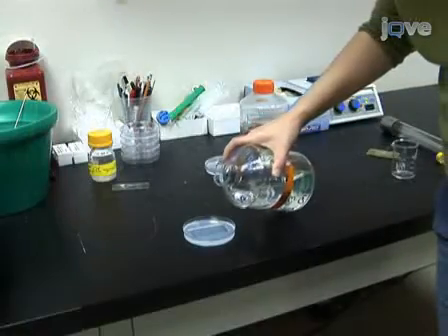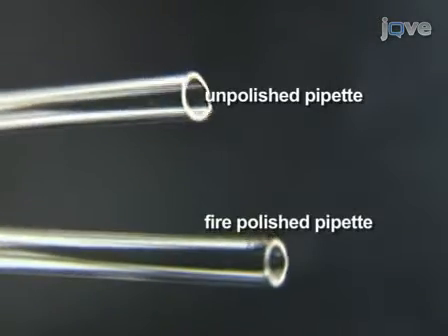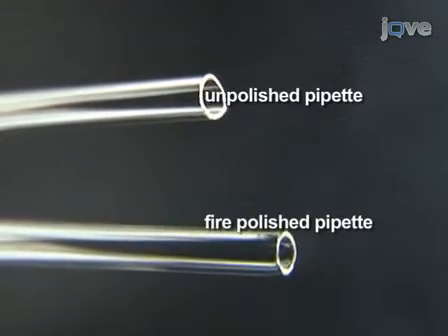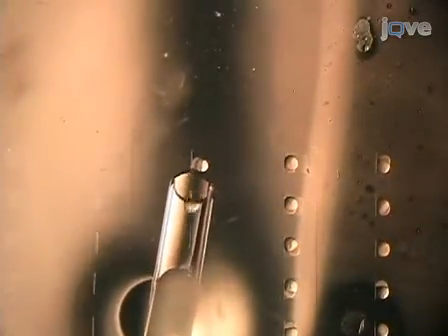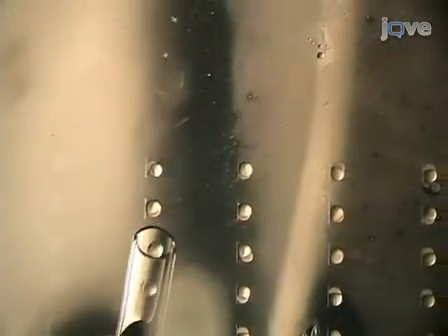Fill the transplantation mold with pen strep embryo medium and load blastula stage embryos individually into each well with a fire-polished glass pipette. Now, transfer the embryos to the transplant wells. Initially, allow them to lie on their side. Arrange the embryos so the donor embryos are placed down one column and the host embryos are placed down the adjacent column.